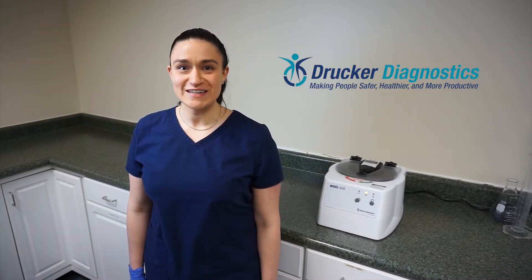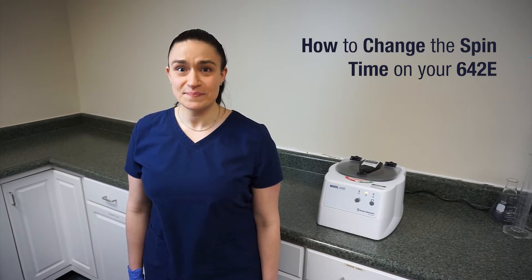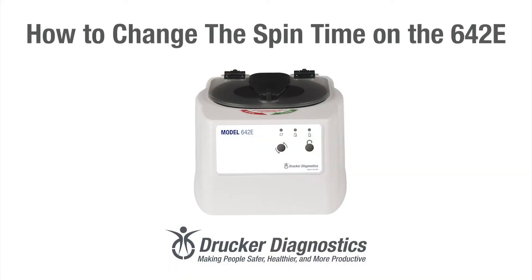Hi, I'm Dawn with Drucker Diagnostics and today we're going to learn how to change the spin time on your 642e.